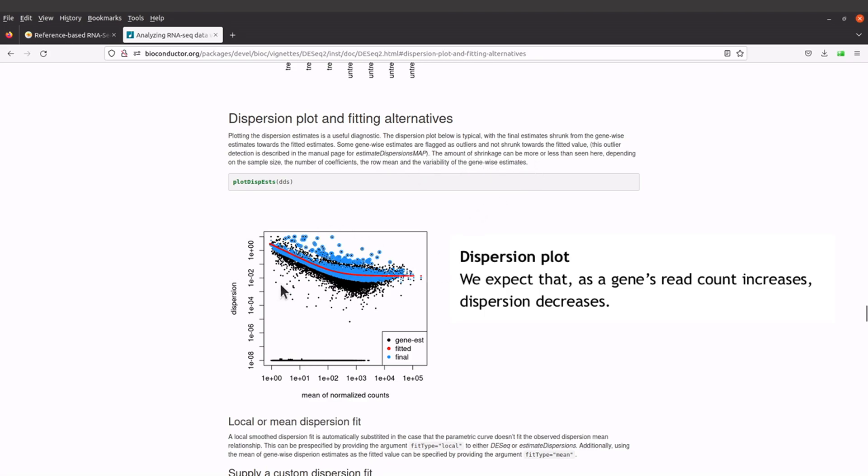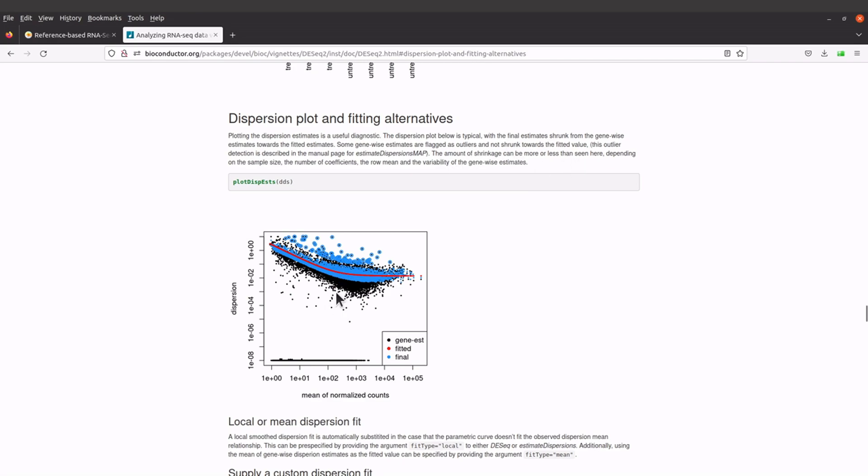With the plots we are looking at the shrinkage, so the amount of shrinkage can be more or less than seen here. If what you have here is different, then you should consider investigating your data. You can look into the sample size, number of coefficients, and the other factors that have been stated here.